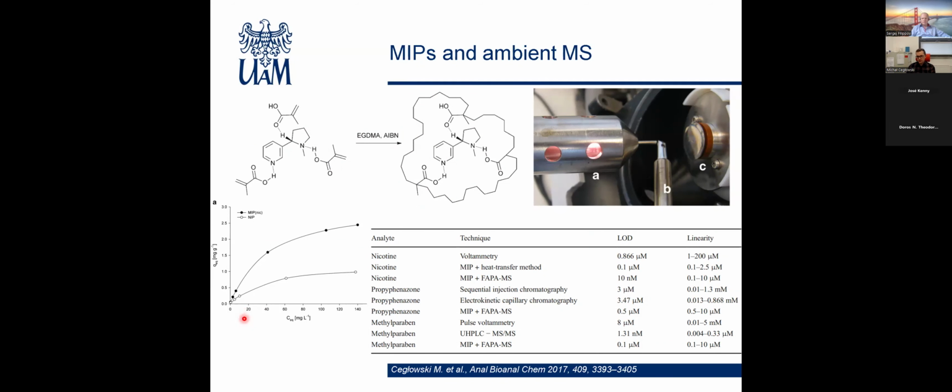They're going to be shown later on in my slides. That's why I always, let's say, tell a few words about what it is. So basically, we usually obtain the adsorption isotherms for imprinted materials, and for the non-imprinted materials, so like our background or our check, to check what is the difference between the adsorption of the non-imprinted polymer, so the one obtained without the template, and the one obtained with the template.